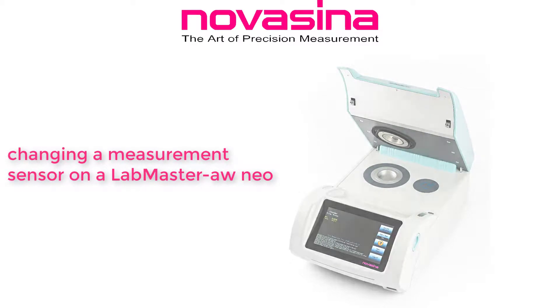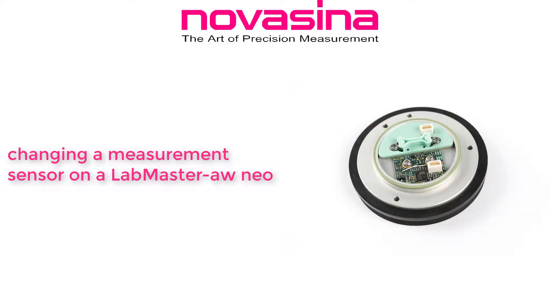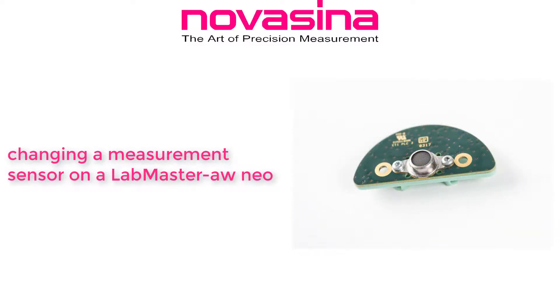This video is about changing a measurement sensor on a LabMaster AW Neo. Before you can proceed, please make sure you have the necessary materials and tools available. To perform this task, you will need the following items.